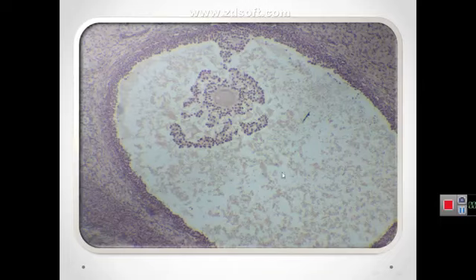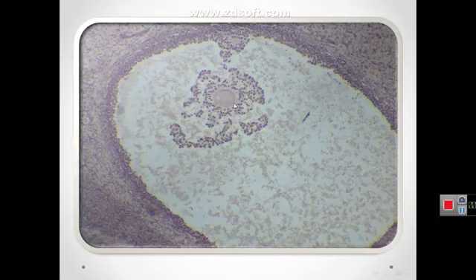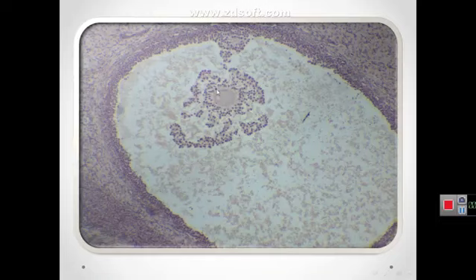The granulosa cells around the oocyte form a small mound called the cumulus oophorus, which protrudes into the antrum. The granulosa cells surrounding the oocyte form the corona radiata. This is a mature or graafian follicle with a single large antrum, where granulosa cells form the corona radiata around the oocyte and the cumulus oophorus bulges into the antrum.